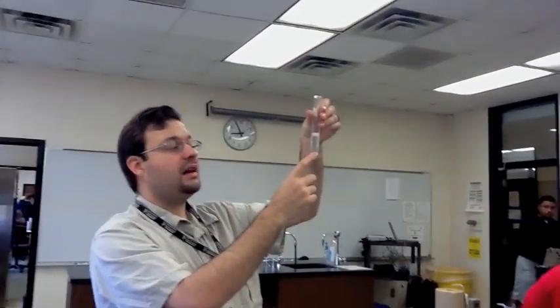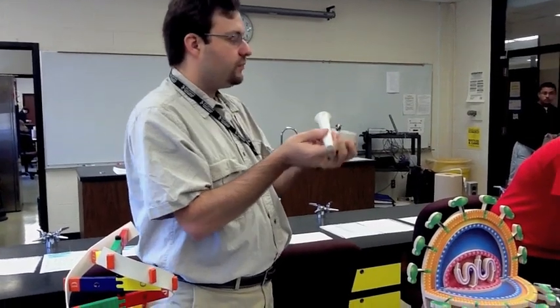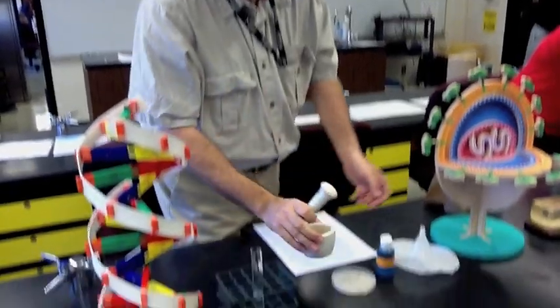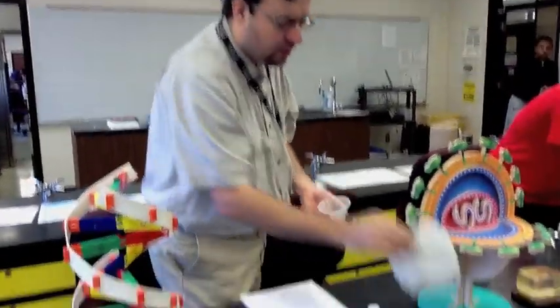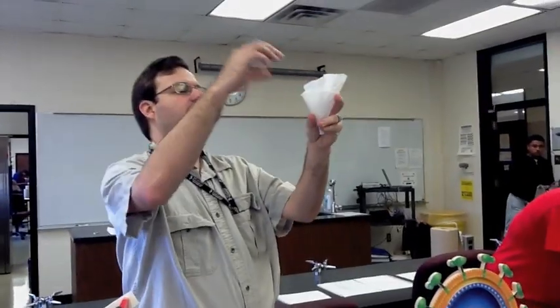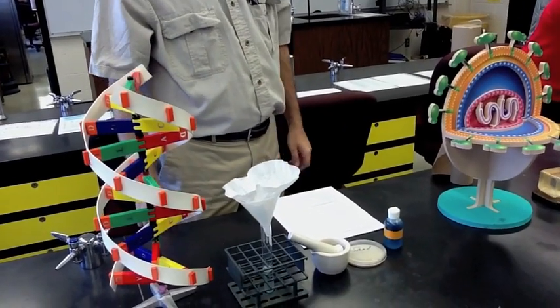For the experiment here, the source of the DNA was your banana. We took that banana and stuck it into the mortar and pestle, and we added sand and DI water to it. We crushed that up until we got that pea soup consistency. We then poured it through the filter paper here, through the funnel into the test tube there. Now, what were we doing with this entire process that I just described? Separating the DNA.